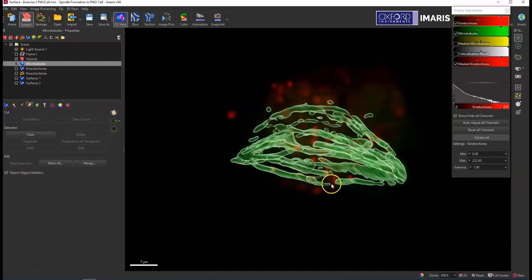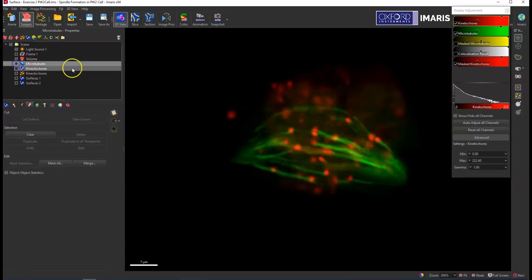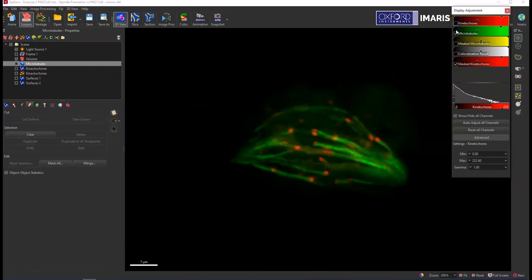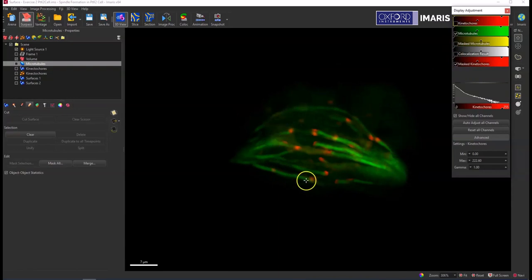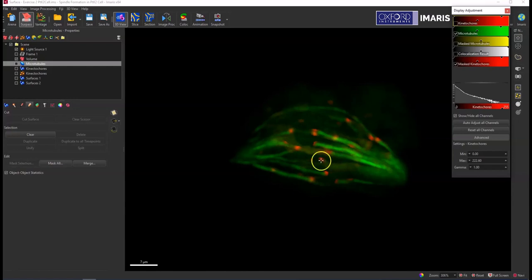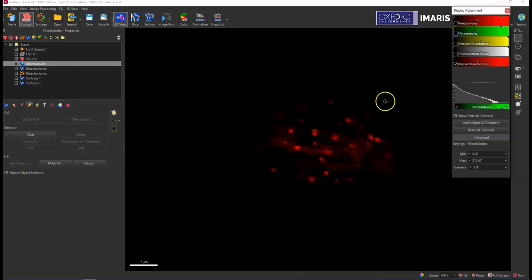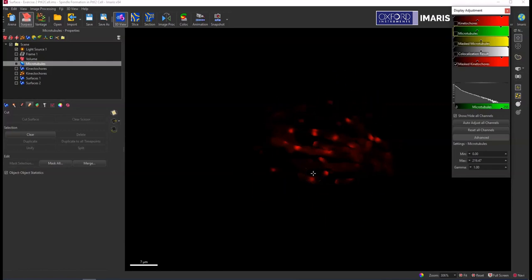And so if I then turn off my microtubules, turn off the kinetochores, and now I have this mask kinetochore channel that is specific to only the red channel that was within that microtubule surface. I can then use this new mask kinetochore channel as an input to create new surface objects or spots objects.